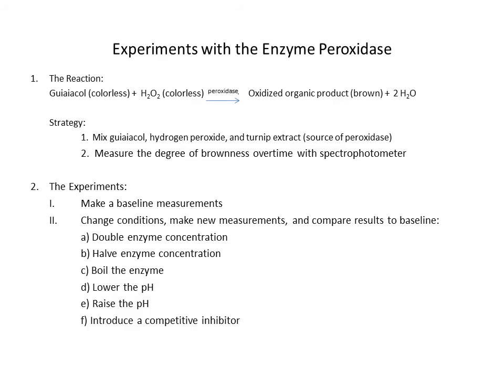And so specifically what we're doing today, we give guaiacol. Anybody know what guaiacol is? It's the roasty flavor in your coffee. So it's actually in bunches of stuff, generally a product of caramelization. And guaiacol. Plus we're giving it hydrogen peroxide. These will help us detect the activity of peroxidase.